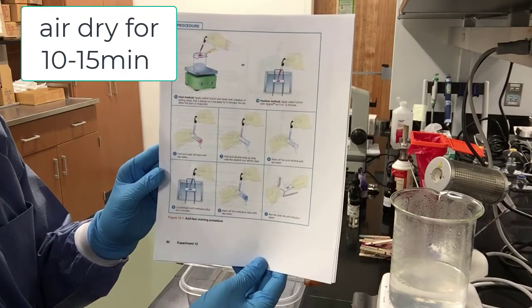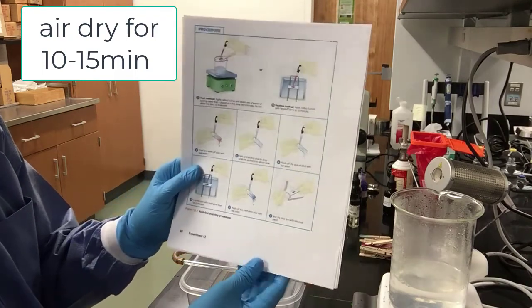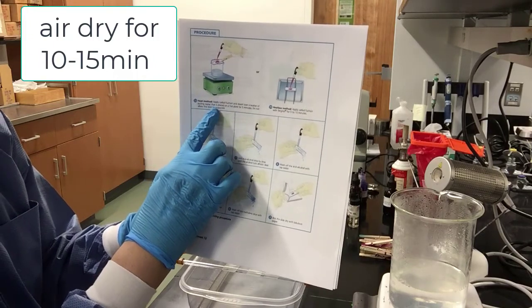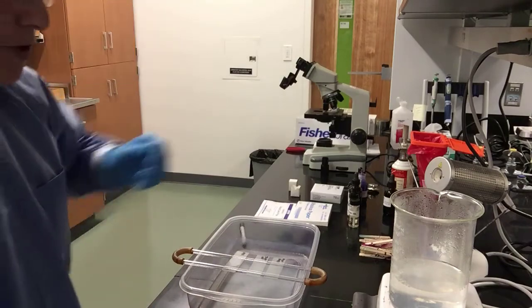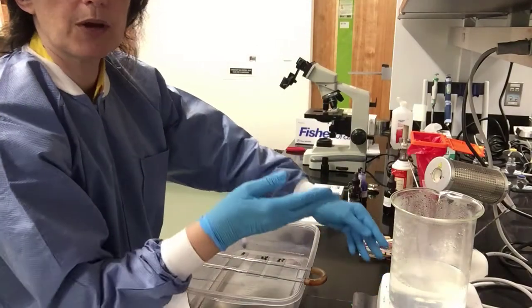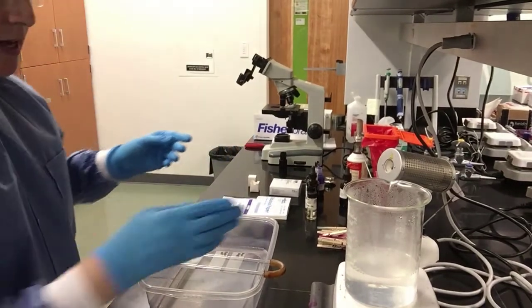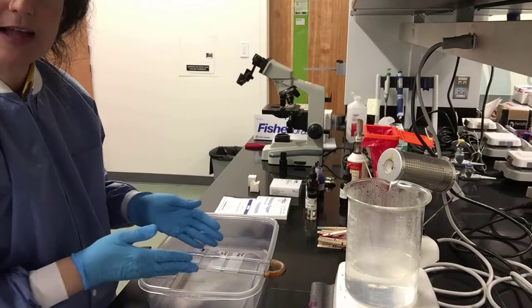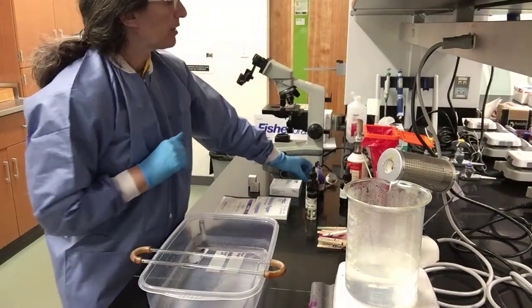We are following the heat method. You can see that on the upper left. We will have to add some washings, some acid alcohol, and then the methylene blue stage along with more washings. Here's our hot plate. Turn my iPad so you can see that. We have steaming water, so we'd like to place these slides now above the steam.